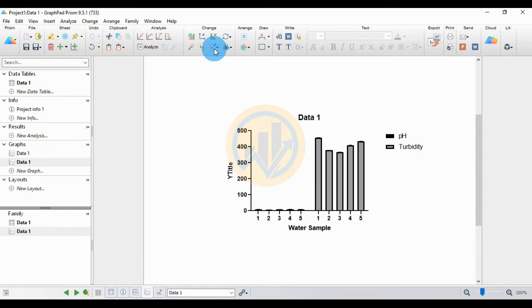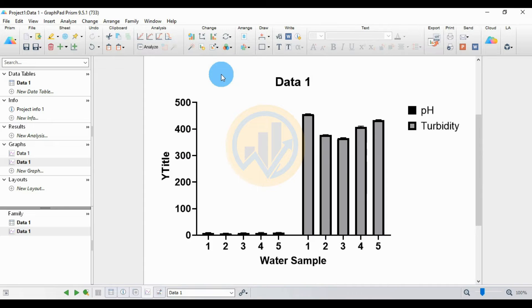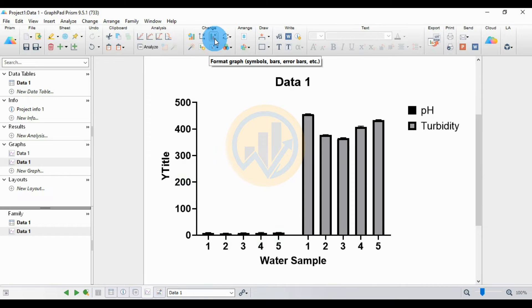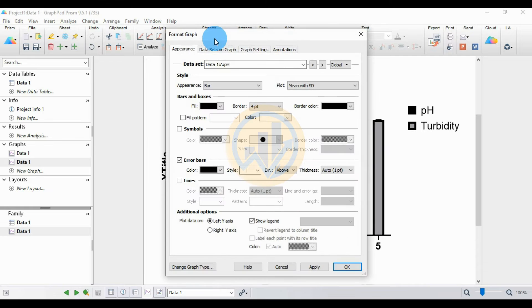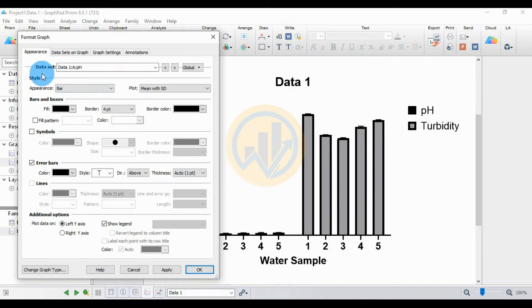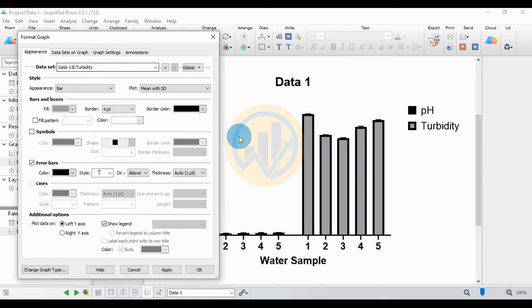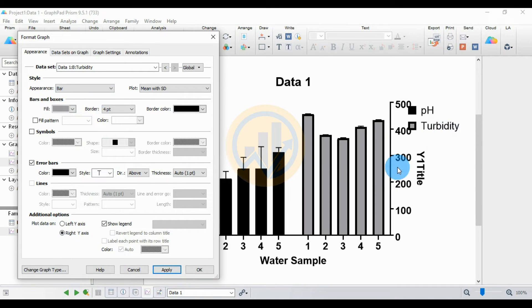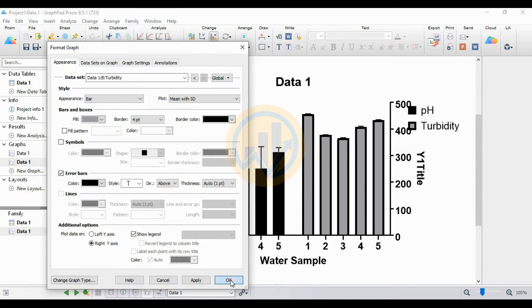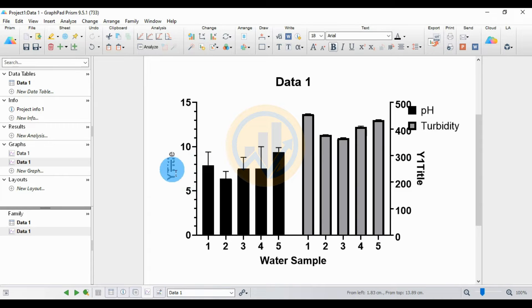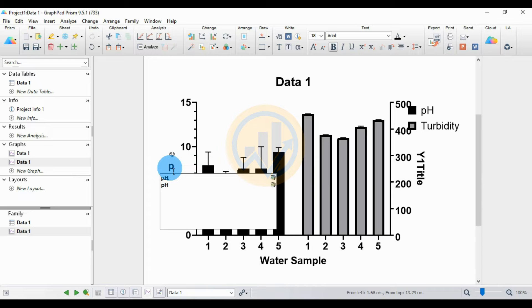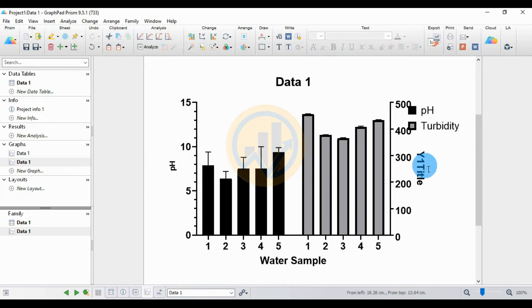The graph is now ready. Increase page fit. Now we customize the graph for the double Y-axis. Click the 'Format Graph' button. In the format graph options, select the first dataset for pH. Next, select the turbidity dataset and choose 'Plot data on the right Y-axis,' then click Apply. The double Y-axis is now created — the left Y-axis is for pH and the right Y-axis is for turbidity.